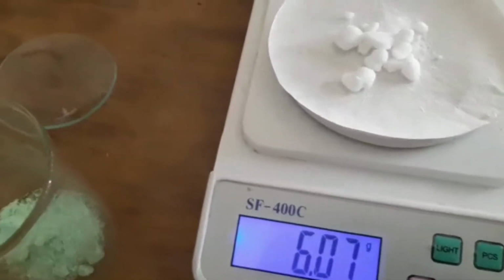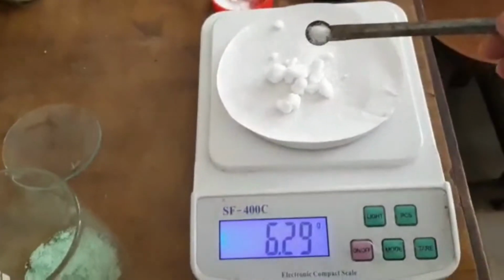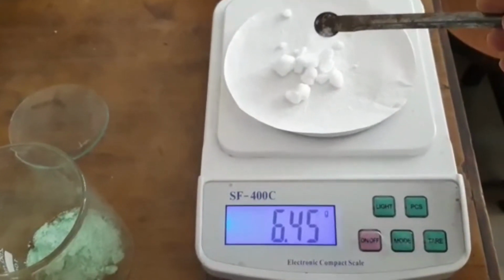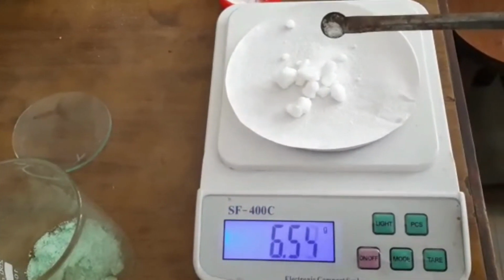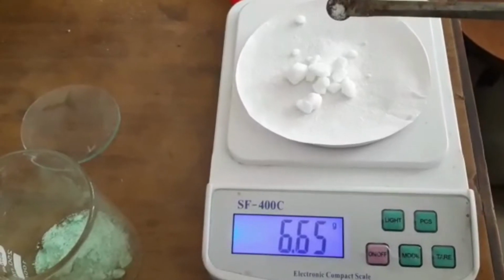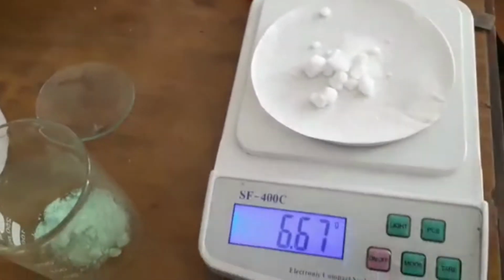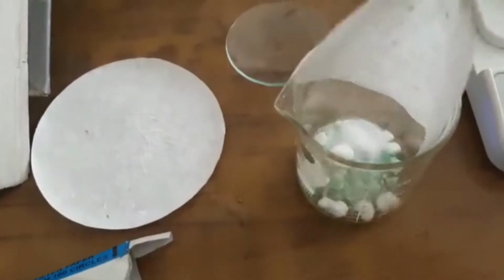So we are going to make it 6.66. 6.66 is what we need. So I'll slowly add towards the end. Yeah, so this is done. 6.66 is what we need, roughly. So I'm going to take this and add this to the beaker to which we have already added ferrous sulfate.